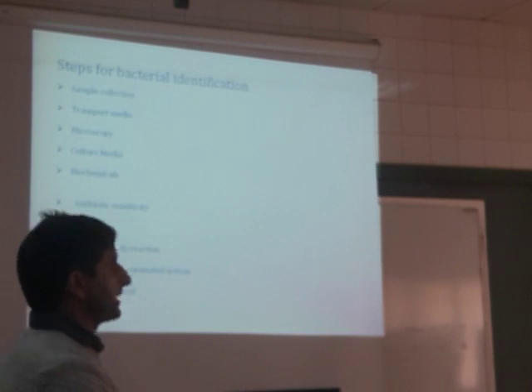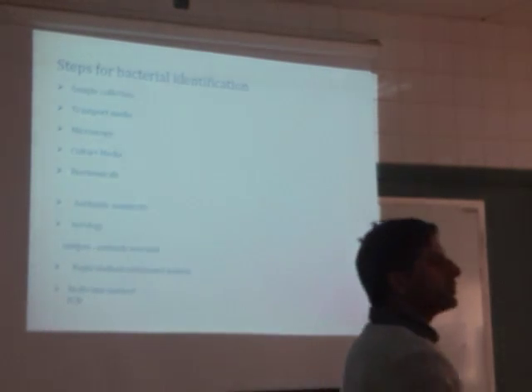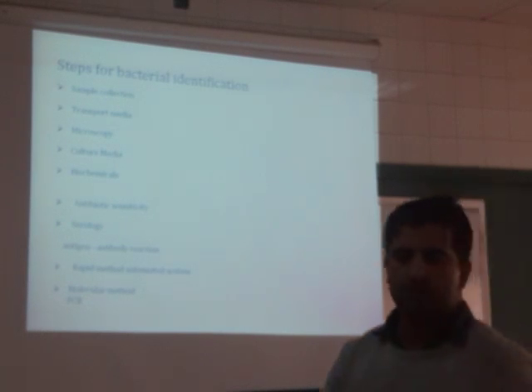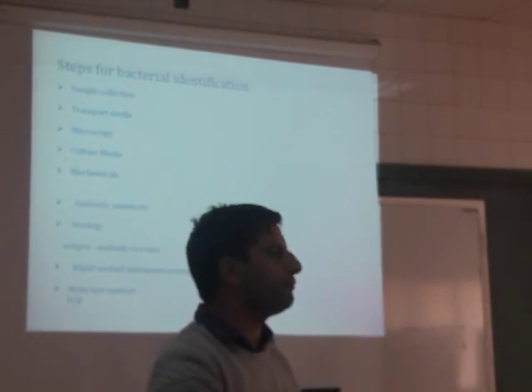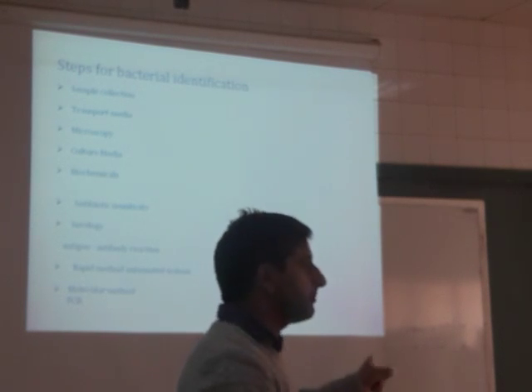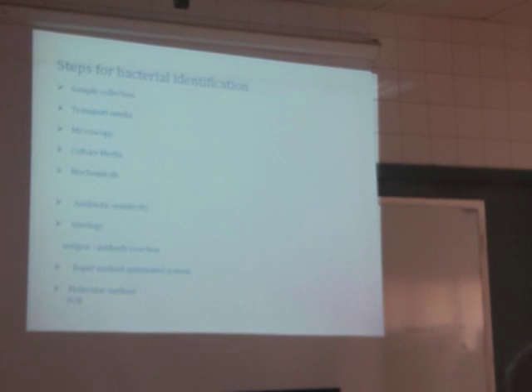And we do the biochemicals. In the biochemicals, we can see whether some bacteria prefer glucose as a source of energy. Some prefer lactose. Some prefer sucrose. Some prefer mannitol. So this is God's nature, that microbes have the ability to ferment different kinds of sugars. In terms of microbiology, we use the term fermentation.